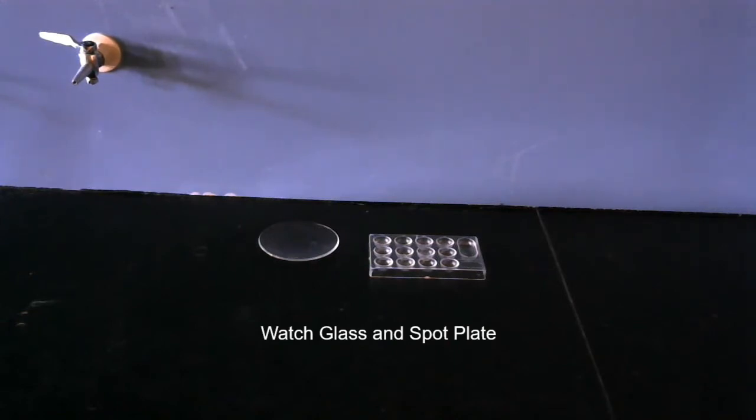The thing on the right is a spot plate, and you can use small amounts of different chemicals to see how they would react. Does a precipitate form? Does it change color? What happens? You can test that on a smaller scale and use less chemicals.